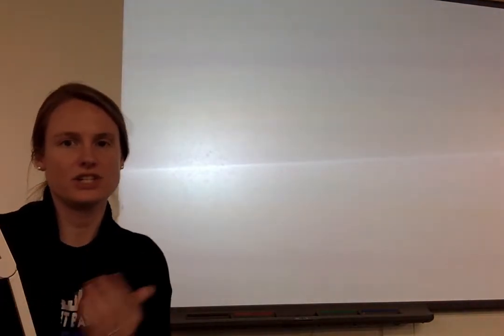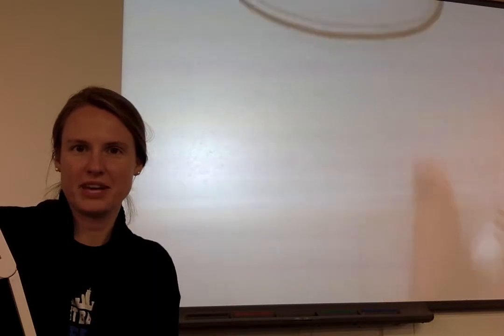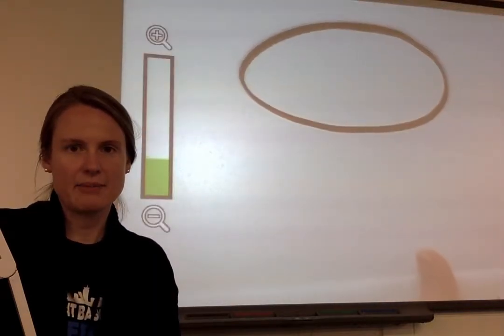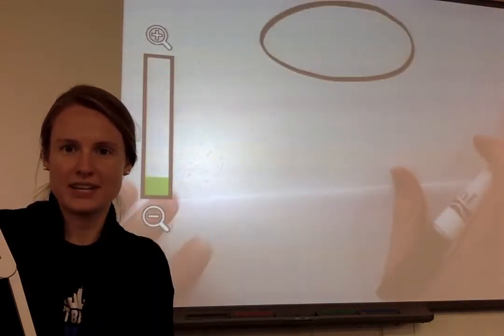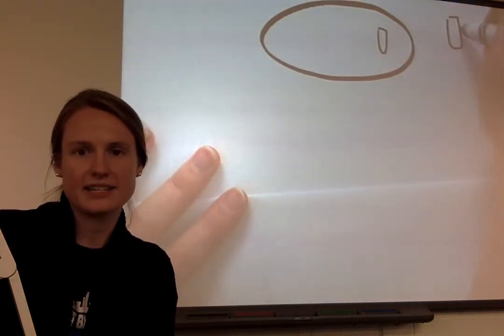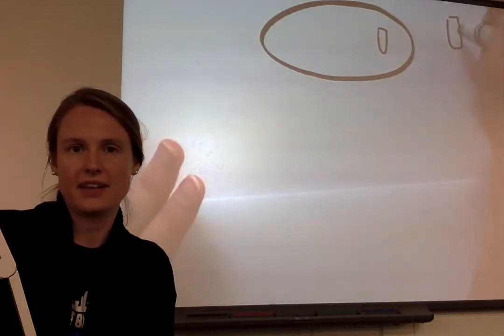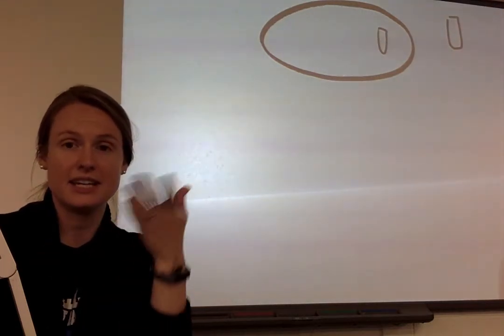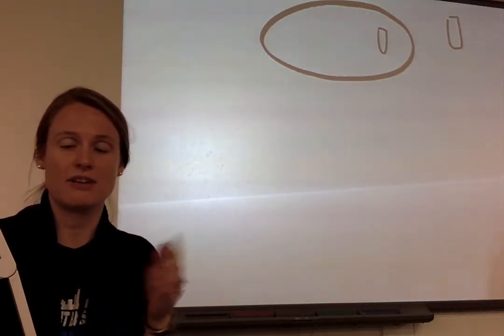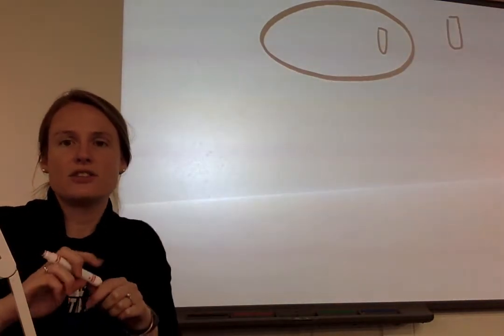So in the lab today, we were trying to figure out what the concentration of solute is in a potato cell. So we basically had a potato. Oh, you can't see my potato. So we had a potato. You saw me taking those chunks out of it, those little core slices, right? So we did that as a collection of cells. It's not an individual cell because one cell is so small, but that allowed us to put potato pieces into beakers of different solutions to try to figure out what was going on. So we wanted to know what the concentration of solute is.